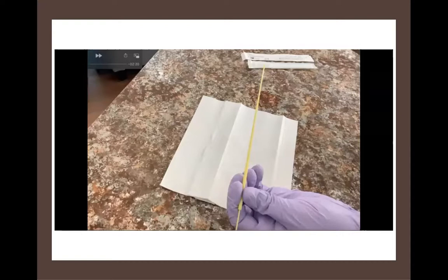This loop allows you to do a single transfer of material and then just toss it into the autoclave bag. You don't need to take the time to put your metal loop into the incinerator, wait for it to get hot, then take it out, wait for it to cool. Instead, you just grab a brand new disposable loop. So again, it depends on the lab you're working in, whether or not you'll be using reusable metal inoculating loops or these single-use items.